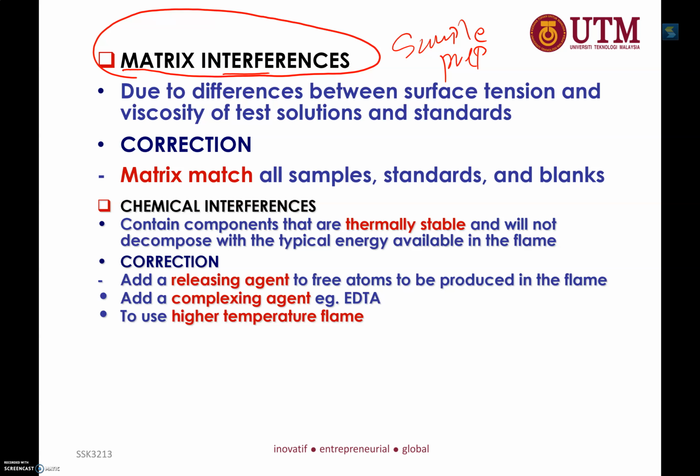the preparation of inorganic analytes, because so far we have been discussing inorganic elements, no more molecular compounds, unlike in UV, fluorescence and phosphorescence. Matrix interference is more significant in atomic absorption spectroscopy because we use digestion and filtration. Later we will learn this in week 7.